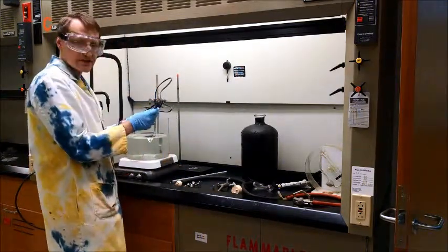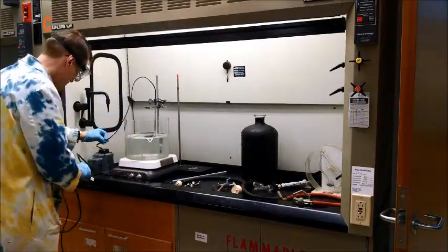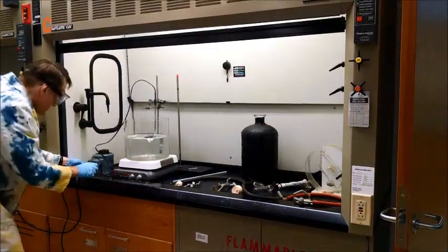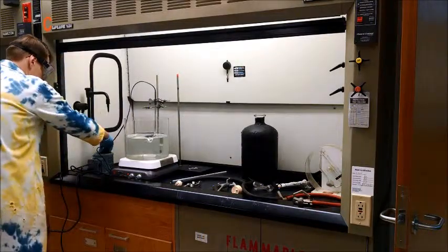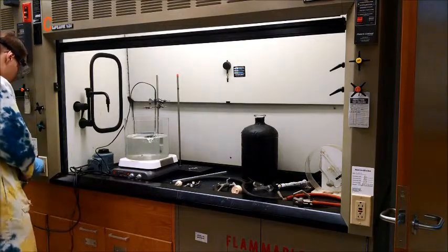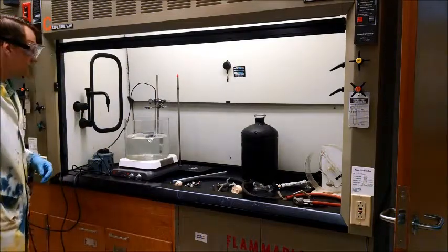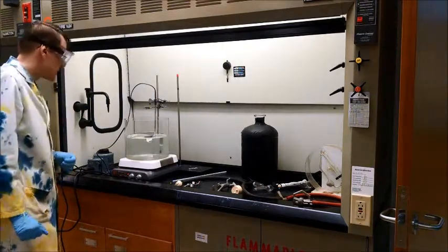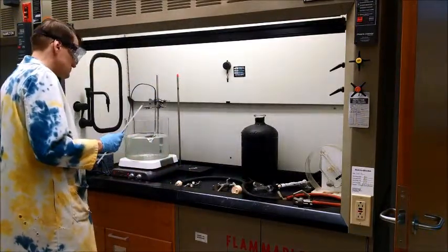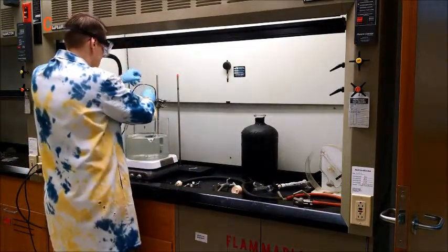Do not plug this directly into the outlet — plug it into a variac. We'll start at a low setting, maybe 20 volts, and see how that goes as far as temperature. Actually, let's leave that off for now. First we'll equilibrate to room temperature for the start of our experiment.